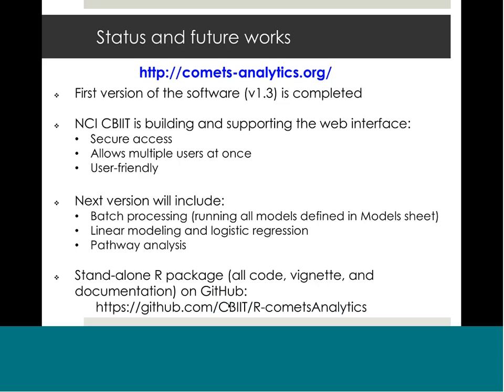So I do want to point out that there is this nice GUI interface, but also an option for those that do know R and do not want to use the GUI. All the code, vignettes, and detailed documentation are on GitHub, and it will soon be released, while we submit the paper or even perhaps before. And it's basically a two-liner install.